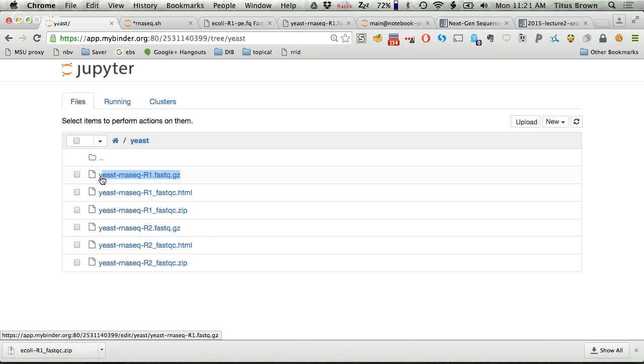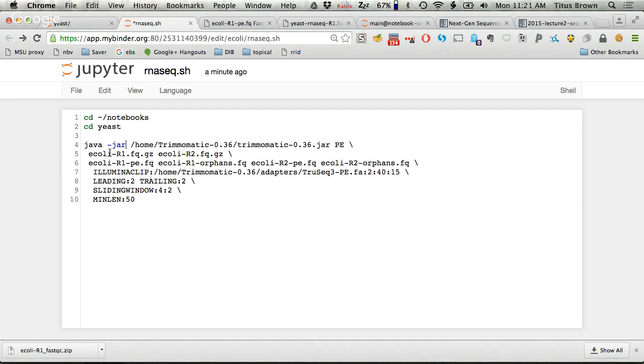You know what? I really do have the attention span of a gnat, so I'm just going to copy that, and I'll put it in twice. And then I just have to remember to change the second one. So always the trick with copying and pasting, and this will happen to you basically all the time. This still happens to me. So you copy and paste, and you'll forget to change things. So you'll have like yeast-RNA-seq R1 and yeast-RNA-seq R1 in the line.